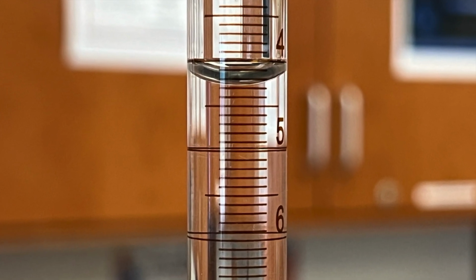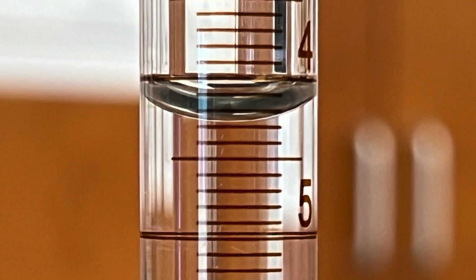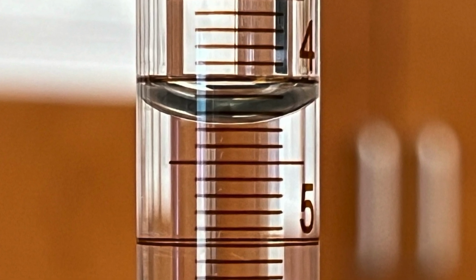Read the final volume of the NaOH to the 0.01 milliliter and record in your data tables. Subtract the 2 volume measurements to get the exact volume of the base added to the flask and record.